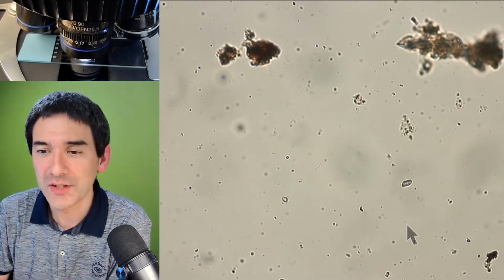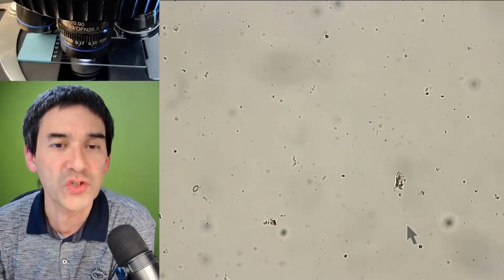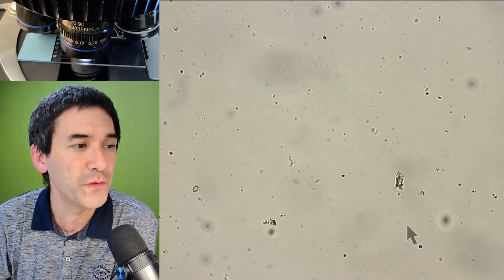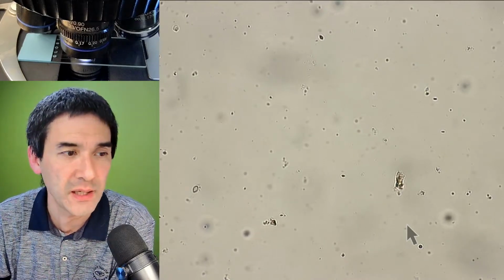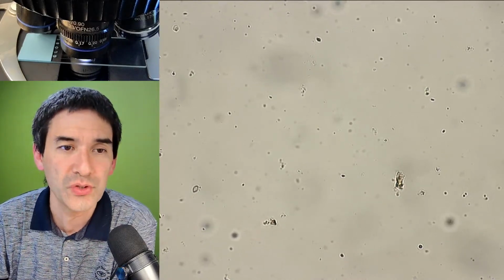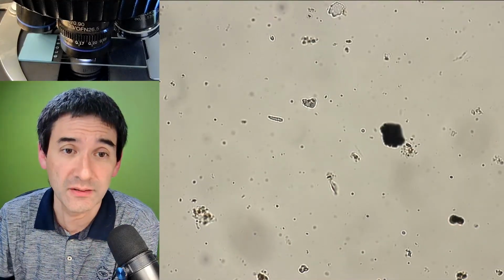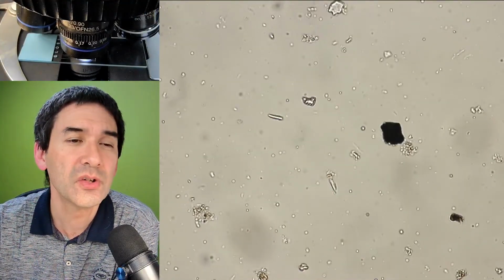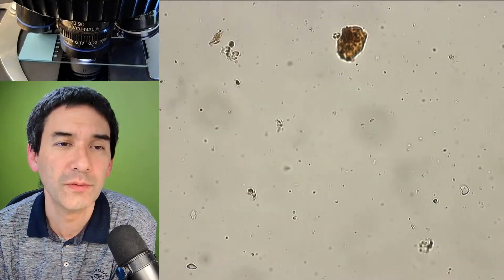So that is simply also something I wanted to clarify here. If you want to observe soil, make sure that it is sufficiently moist, so that microorganisms are given some time to reproduce and grow, and then make sure that the slide is also sufficiently flat. Okay, and then you're going to see a lot of bacteria, hopefully.